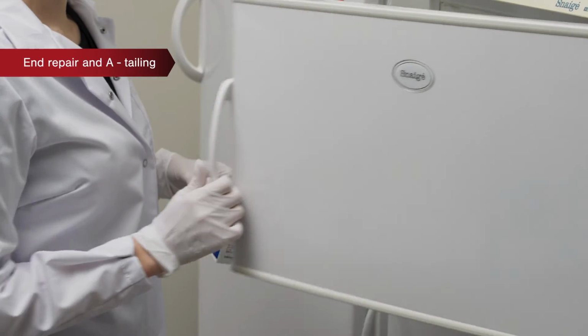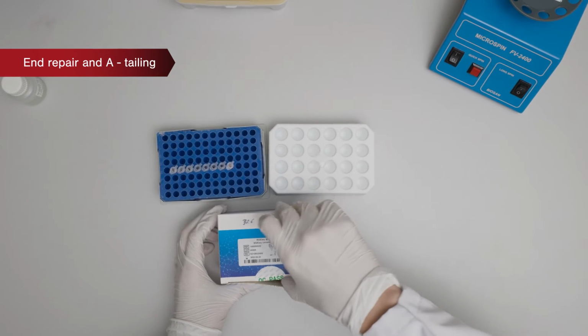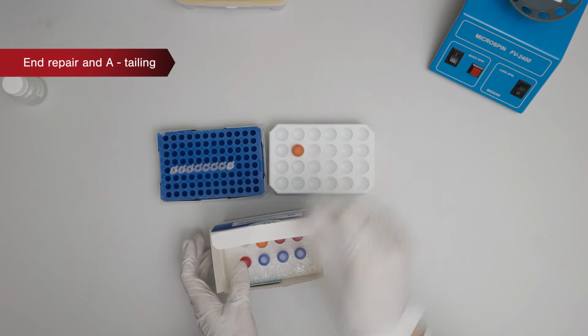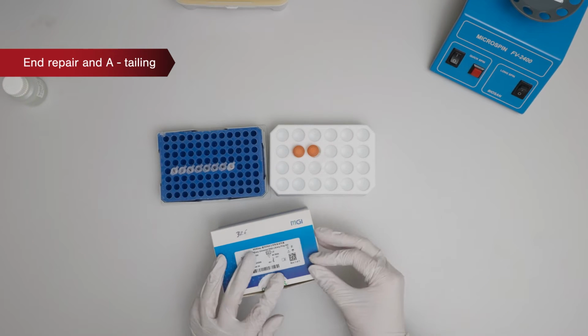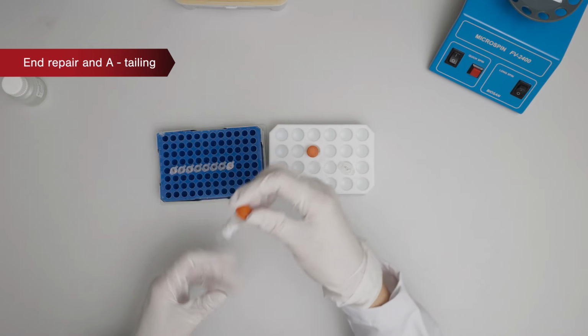After previous steps, the ends of the fragments are uneven. Therefore, end repair is performed. During end repair, DNA polymerase is making the fragments' ends blunt and even. After the blunt ends are made, the poly A tail is added, which will serve as attachment site for adapters, since adapters contain thymine overhang on one end.